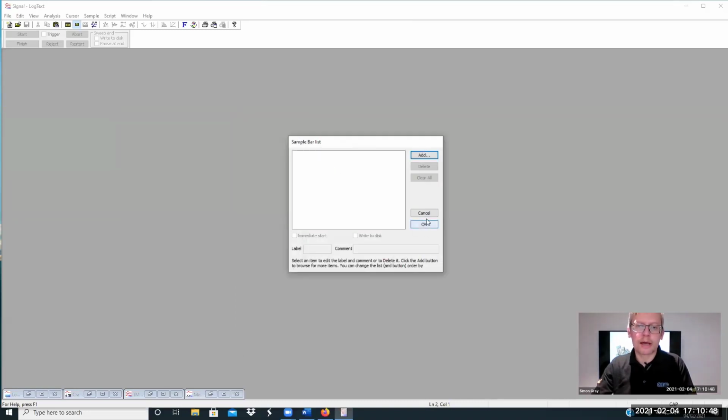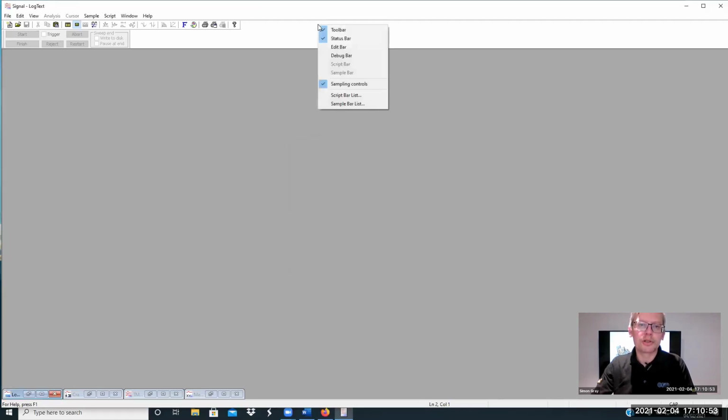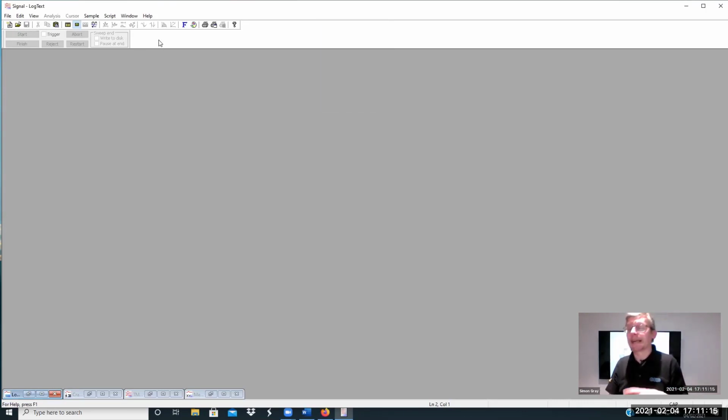That could have its own comment added to it. And once we've finished, we would add the script and sample bar to the screen here, at which point clicking on the buttons represented over here at the moment, clicking on each of those buttons would load immediately the configuration or script and run it or get the data ready to sample. Okay, so it's a lot faster step, especially again with TMS, where you want to move from baseline monitoring to then go to SICI to LICI, etc. It's a one-click process.